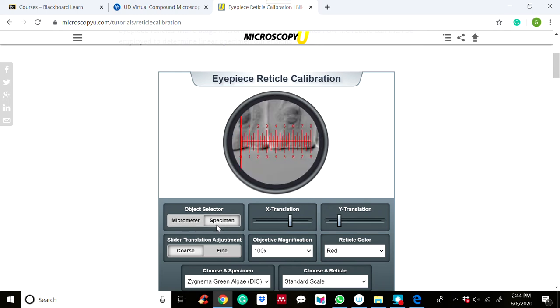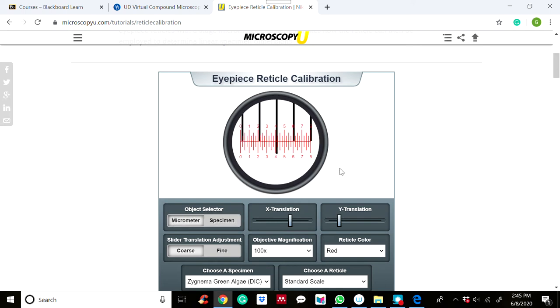If you have a specimen on the stage, you can see it through the microscope together with the eyepiece graticule scales. Now, if you remove the specimen slide and substitute it with the micrometer slide, your image will look something like this — the red scale is your eyepiece graticule, while the black one is your micrometer scale.